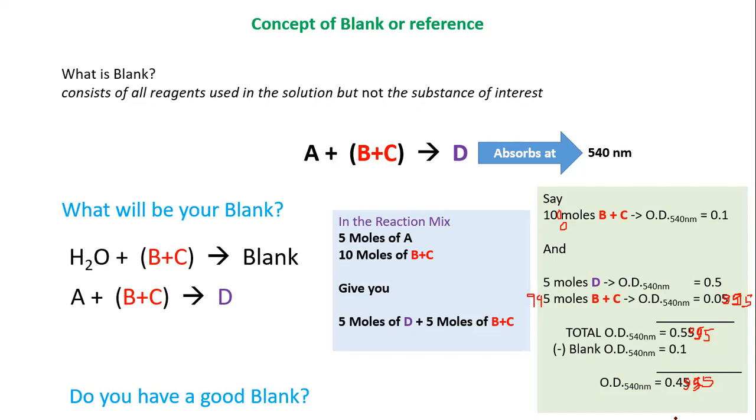Now go back to the tests that you performed during your practical class, say protein estimation. The concentration of protein is in terms of micrograms, while the alkaline copper is in terms of grams, almost 1,000,000 times more than the concentration of protein.